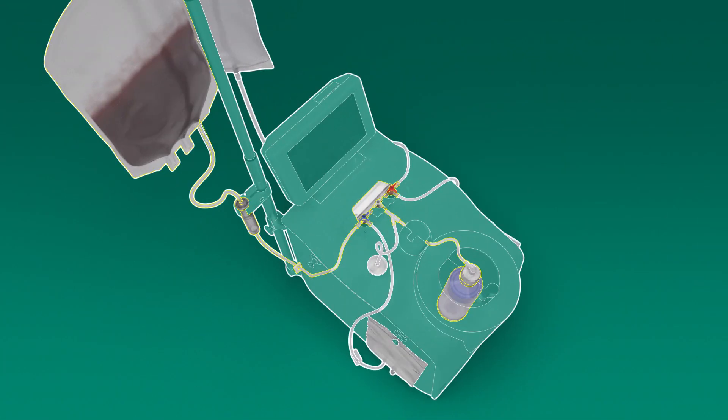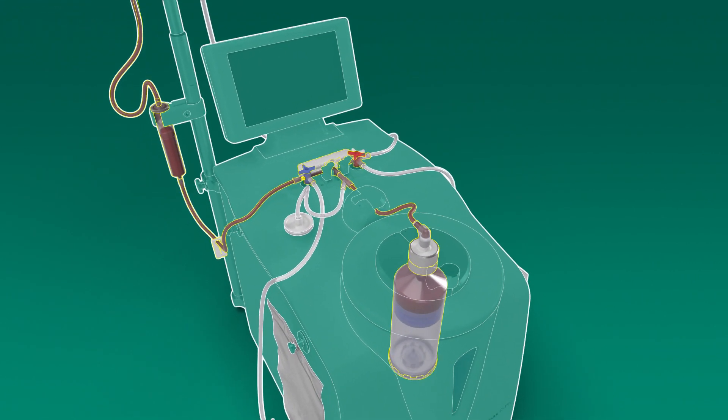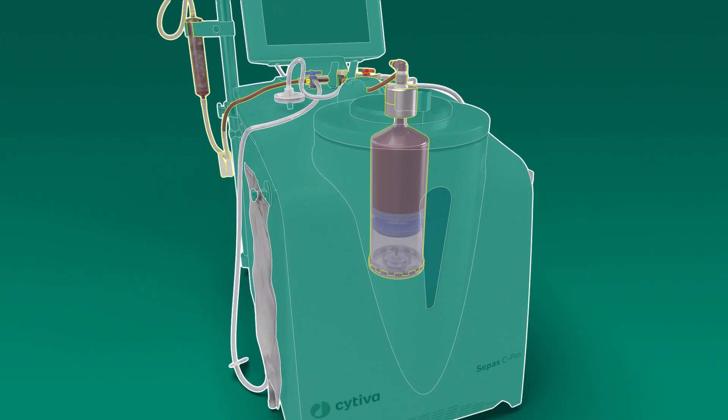The separation chamber piston and stopcock manifold work together to fill the initial product into the separation chamber and additional solutions if required.